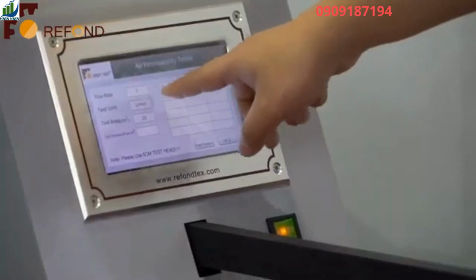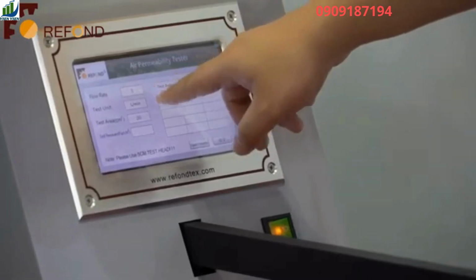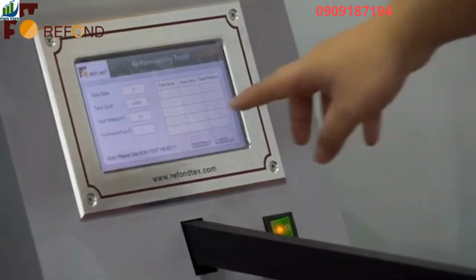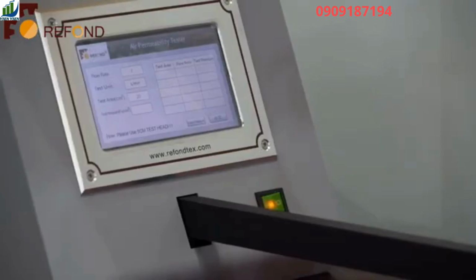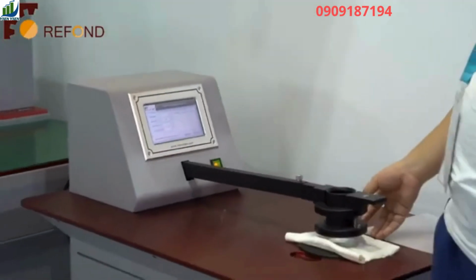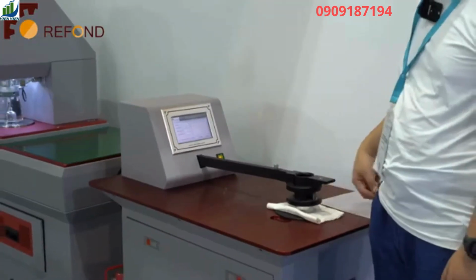For this fixed flow rate test, the standard requires an 8 liters per minute flow rate. When doing the test, the machine will control the flow rate flowing through the face mask to be 8 liters per minute. Then the pressure across the mask is the main measurement required by the test, and it will be used as the result.